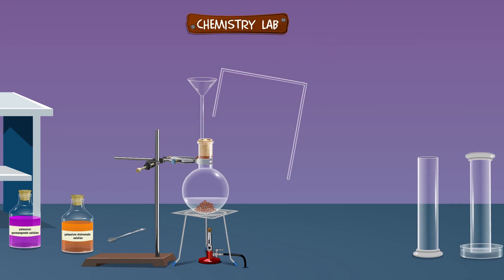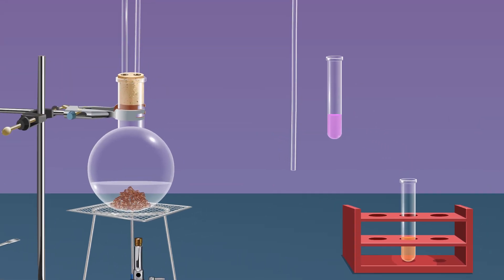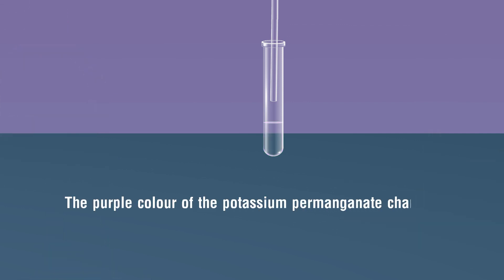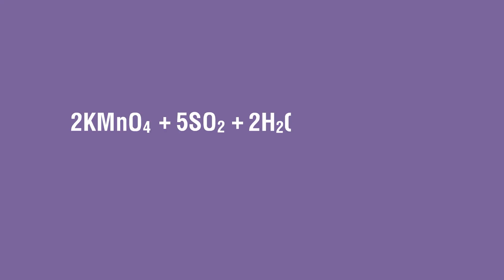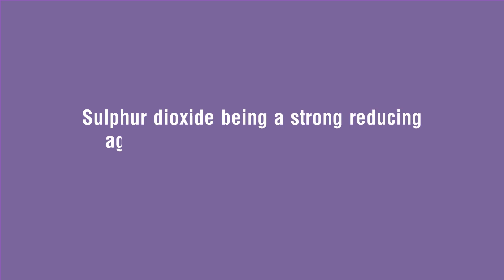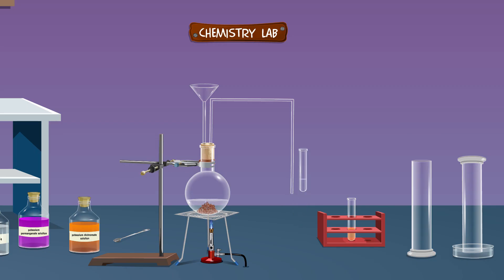Make the proper arrangement so that the production of sulfur dioxide gas is ensured. Pass the sulfur dioxide gas into the test tube containing potassium permanganate solution. We observe that the purple colour of the potassium permanganate changes to colorless when sulfur dioxide gas is passed. Sulfur dioxide is a strong reducing agent that reduces the purple coloured solution to form a colorless solution: 2KMnO₄ + 5SO₂ + 2H₂O → K₂SO₄ + 2MnSO₄ + 2H₂SO₄.